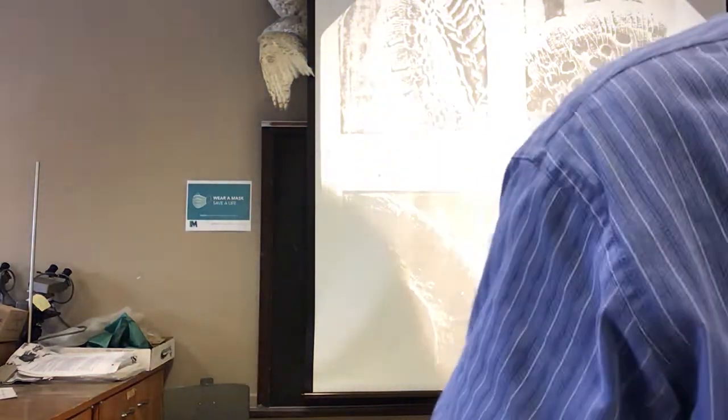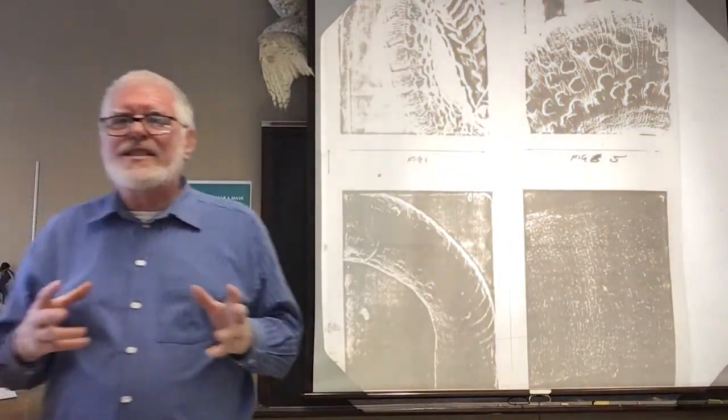You've got two ways to process the imaging beam. You can pass the imaging beam through your object, transmit it, that's a transmission microscope. You can bounce the beam off of the object, that's a scanning scope. It used to be called a reflective microscope, but for electron beams, you actually scan the beam across the surface and pick up the reflections.